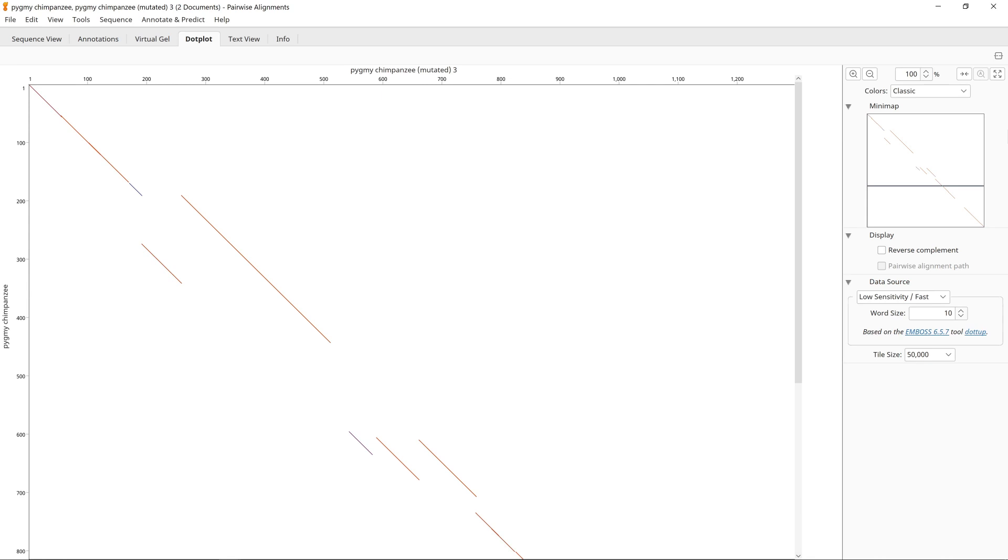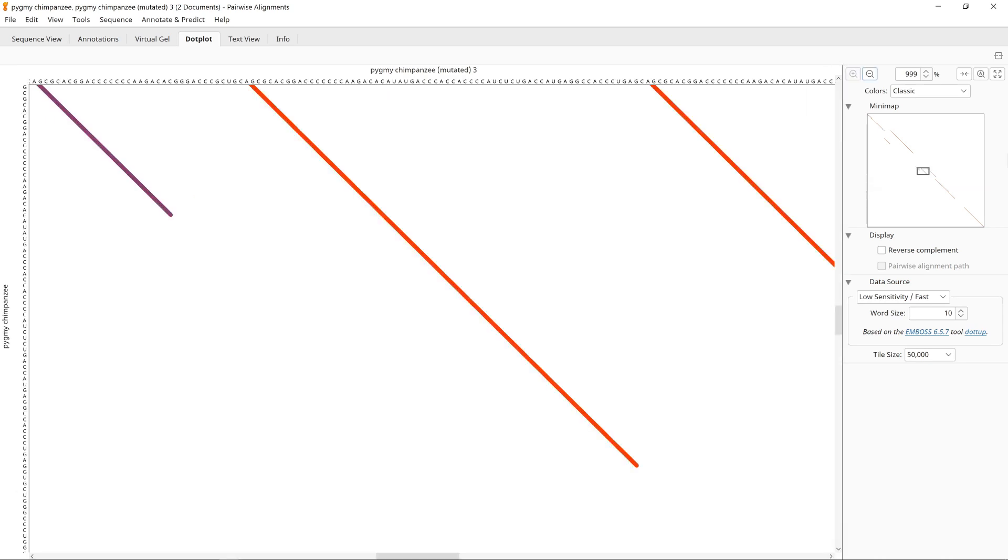You can zoom in and out on the dot plot by adjusting the zoom level. If you zoom in enough, you'll be able to see the individual letters of the two sequences on each axis.